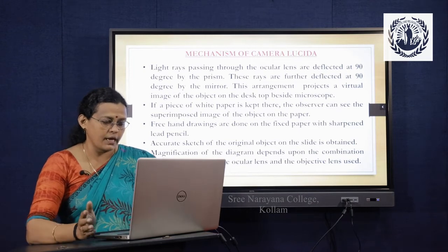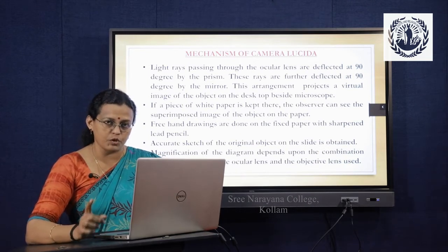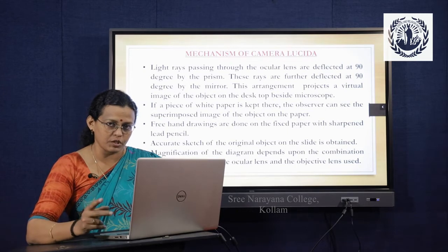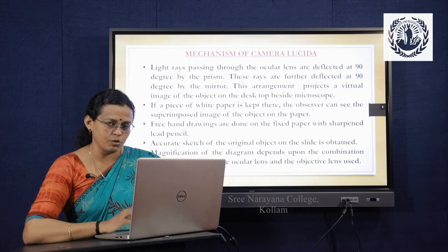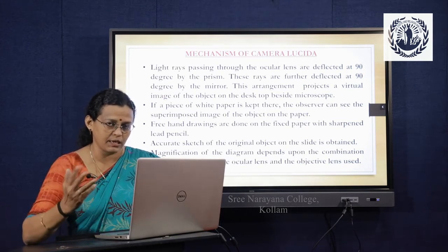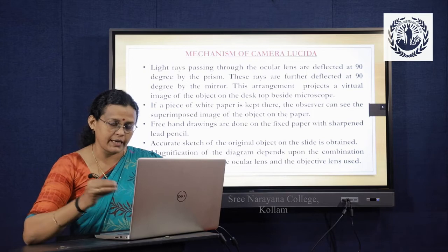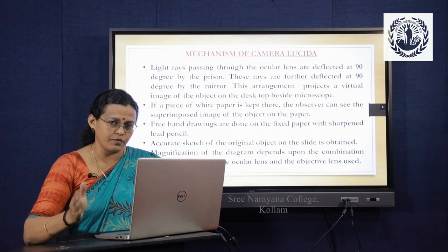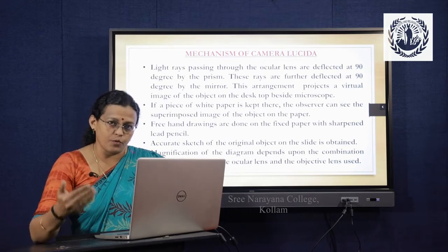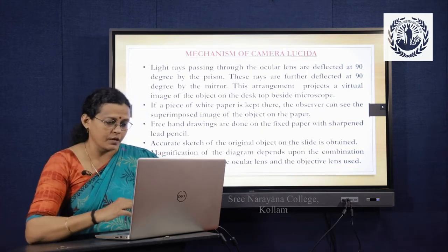Now, as you know, in a compound microscope there is a pair of lenses. One is the ocular lens and the other is the objective lens. So the magnification will be a combination of the ocular lens and the objective lens that you use. The ocular lens is usually 10x, that is, it magnifies 10 times the original size of the object, whereas the objective can be 40x or 45x. So a combination will give 100x or 450x or 400x magnification. That means the magnification will be about 400 times the original size of the object. So that is how it works.